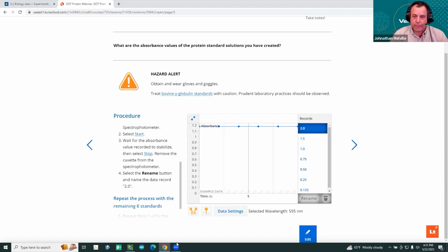Now, before I get going, does anybody have any questions about how the spectrometer works, or what you can use in LT? The one thing to know is that live data collection in LT right now only works on PCs. You can get the sample data on other platforms, but live data collection only works in Windows or on a PC. So any questions?